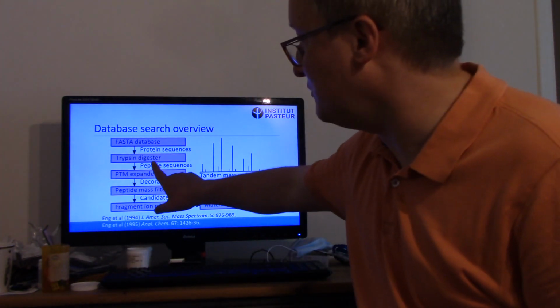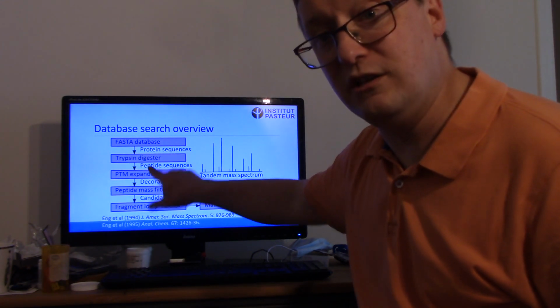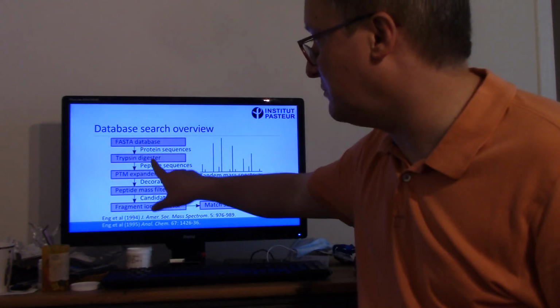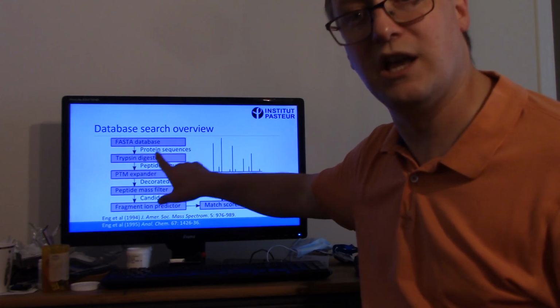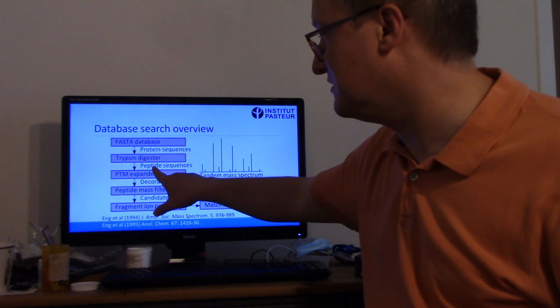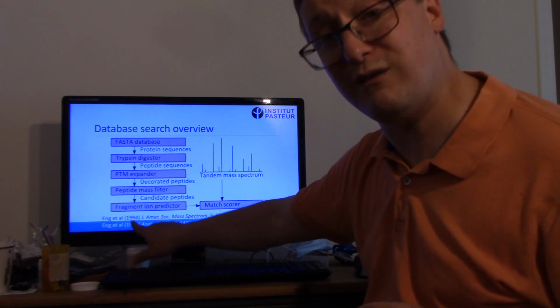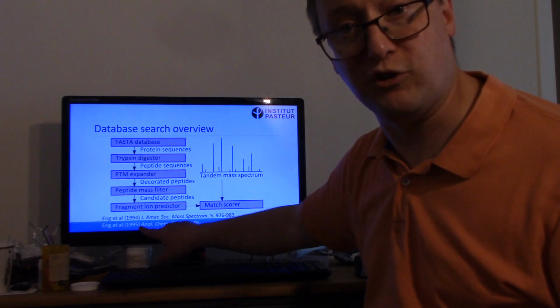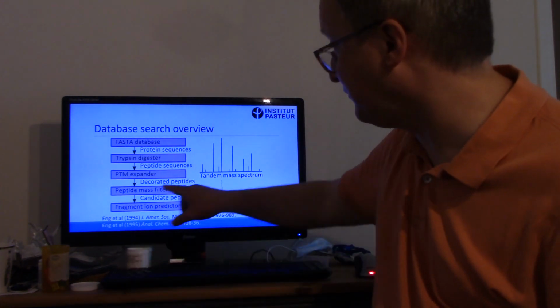Okay, so these protein sequences, in silico, in the software, need to be digested like they would have been with trypsin on the bench. So we need to emulate the behavior of trypsin in the software to create the peptide sequences that would result from those protein sequences. These peptide sequences then need to be expanded in some way. I'm going to note that I'm mixing together information from the original publication of SEQUEST in '94 and the follow-up version in 1995 that added post-translational modifications.